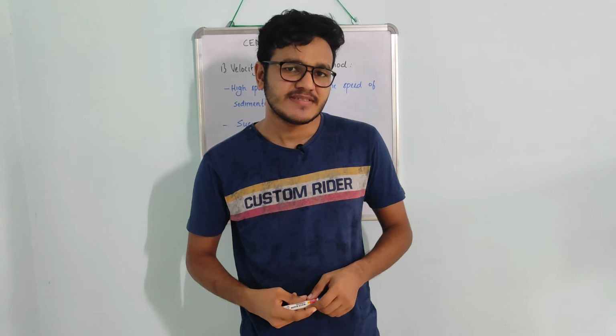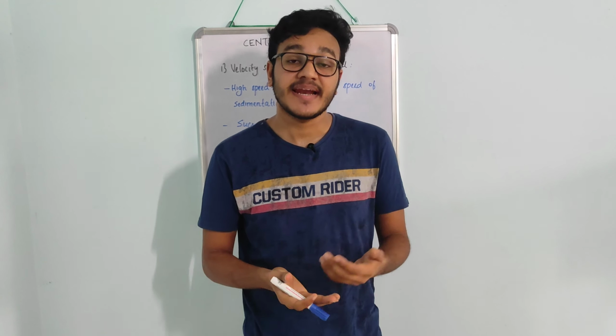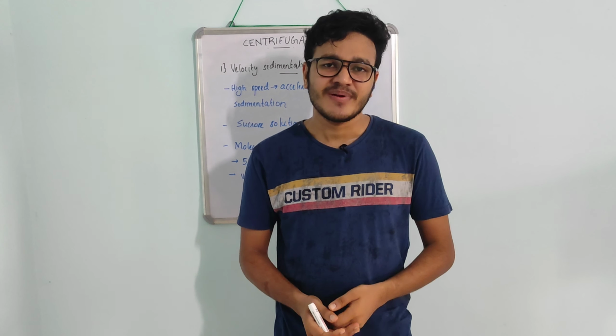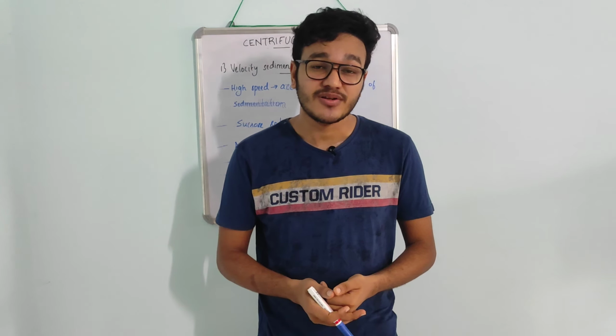In the last session we dealt with the basics of differential and density gradient centrifugation. In this class we will be dealing with a short session, a little more about centrifugation, two or three terms related to centrifugation.